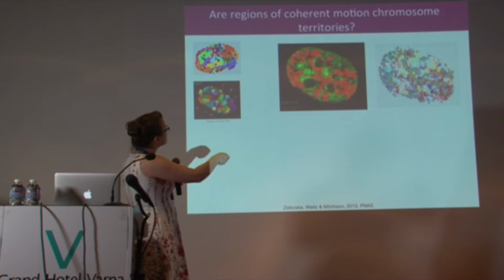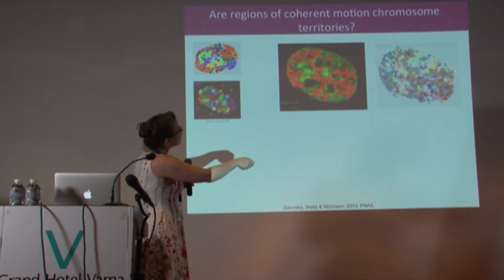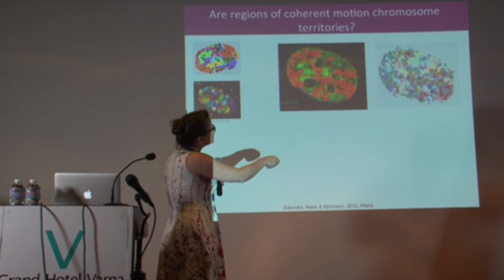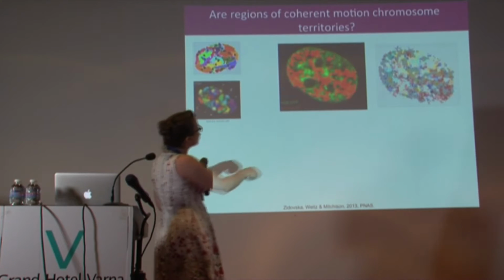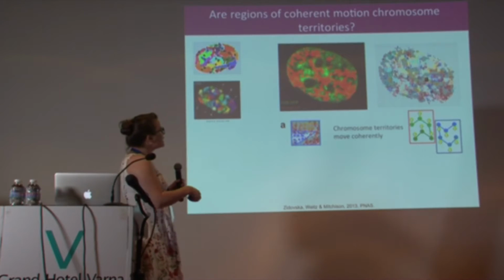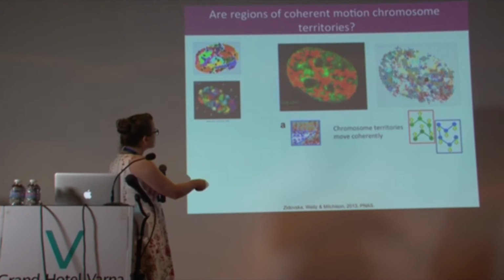That allows us to simultaneously measure from the green signal our DCS map, those are the arrows in this image, and from the red signal, which corresponds to the gray mask in this image, the boundaries between the gray and non-gray, or red and non-red regions, give you the physical boundaries of chromosome territories. So you can analyze this type of data and overlay this dynamic information with the static information and look at where the territories sit.